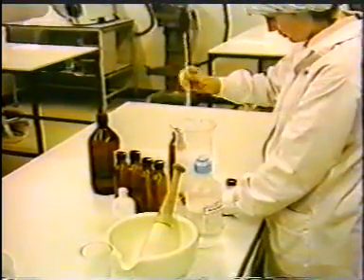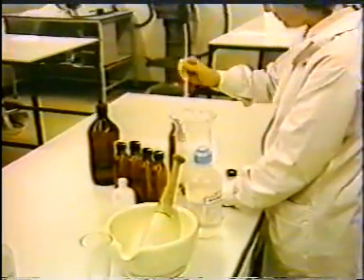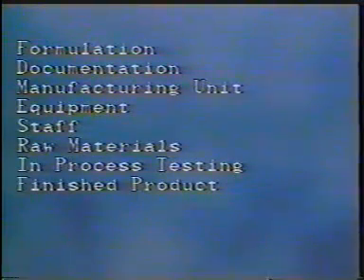So what has this program been saying about quality control? There are 8 steps which should produce a satisfactory product. A satisfactory formula from which trial batches are made and on which chemical and microbiological testing takes place. Formulations and method of manufacture must be documented on a master batch sheet. All master batch sheets and general procedure sheets must be approved by quality control.